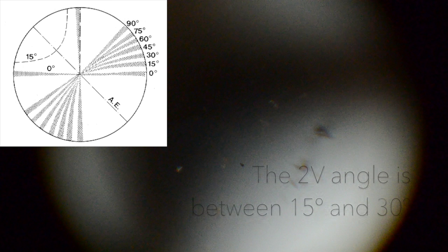Now let's determine the 2V angle. What do you think? Our isogyres are much more curved than the previous example, so the 2V angle is between 15 degrees and 30 degrees.